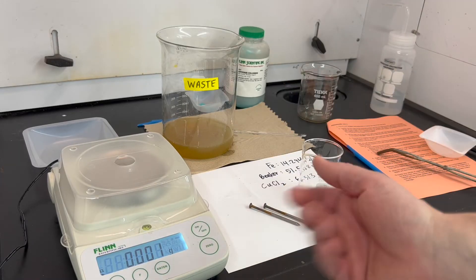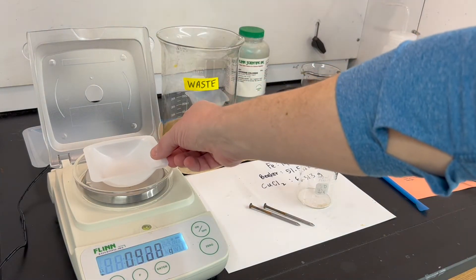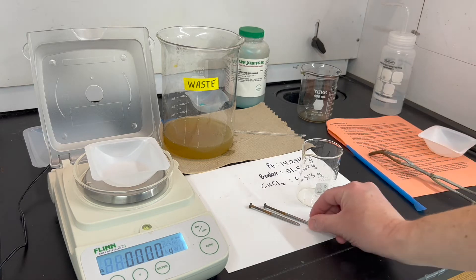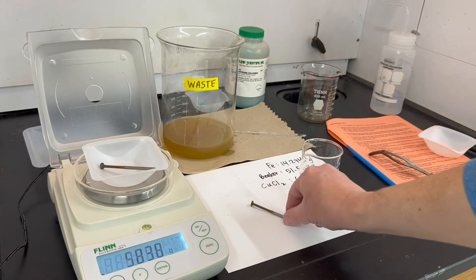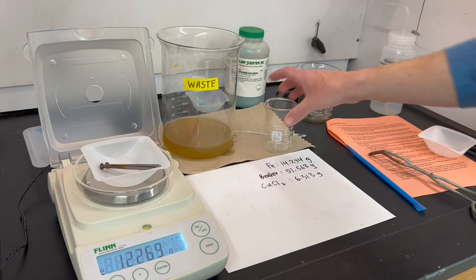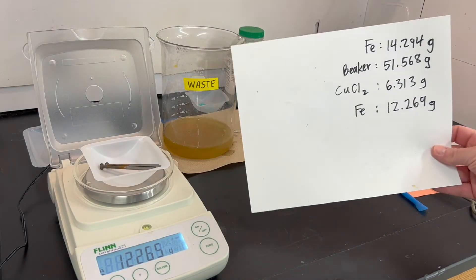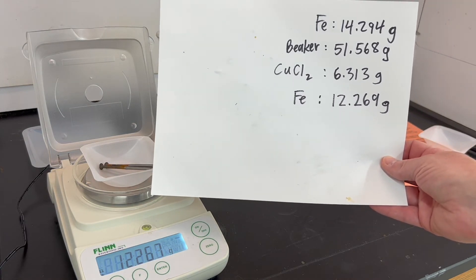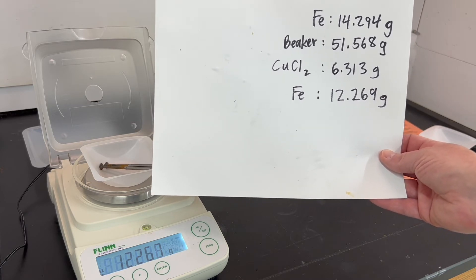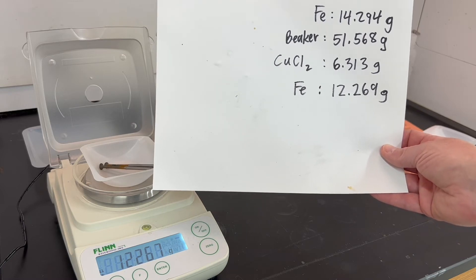For the nail measurement, I prefer not to put the nails directly on the balance pan, so I'll zero it with a weighing dish on the scale. The nails are cool, so I can go ahead and weigh them. The mass is 12.269 grams. Yesterday the starting mass was 14.294 grams — it has decreased because some iron was converted into the iron chloride product. We can check the 12.269 grams against our VCA chart and stoichiometric calculations to see how close we are to the prediction.